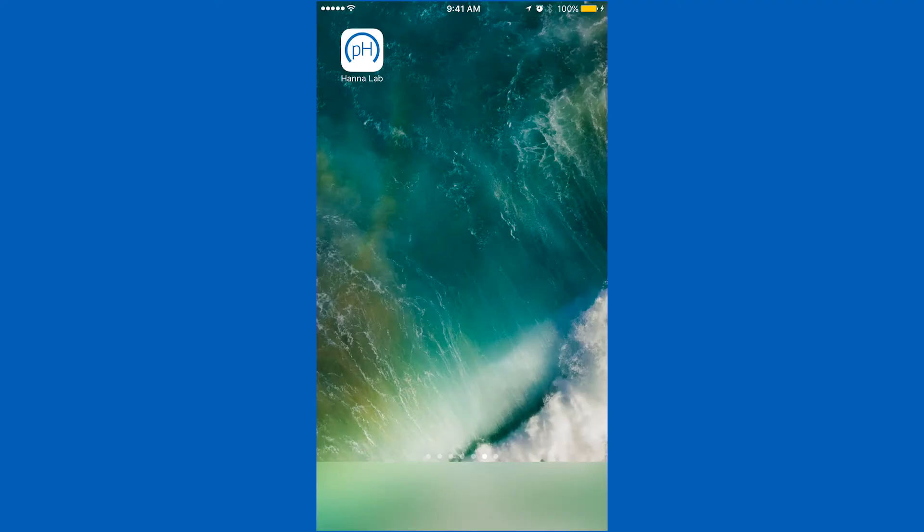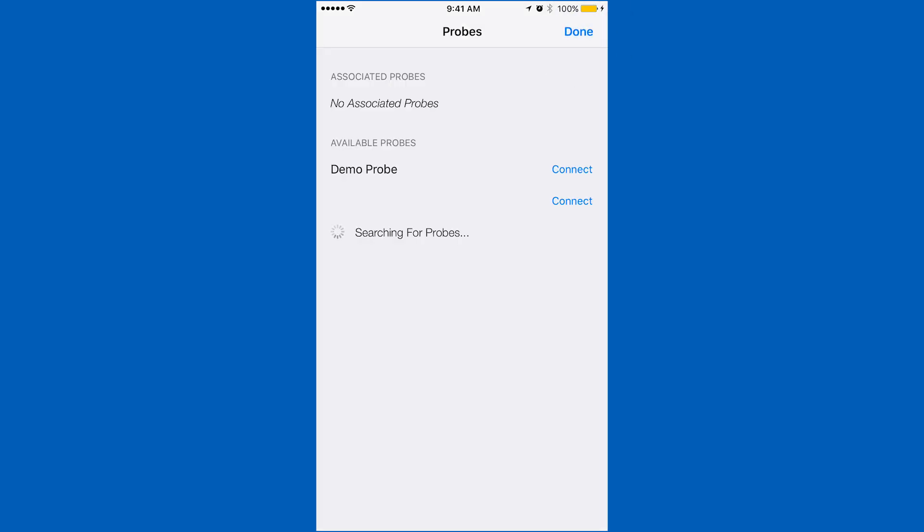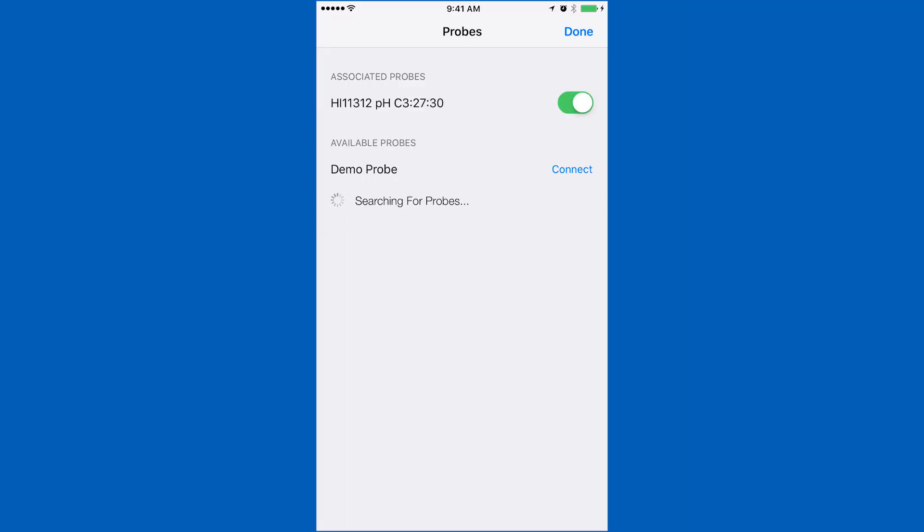To connect your Halo, be sure Bluetooth is enabled on your device. Open the HANA Lab app and press the Bluetooth symbol. Press the button on your Halo and the app will recognize the electrode. Tap connect and you'll be ready to calibrate.